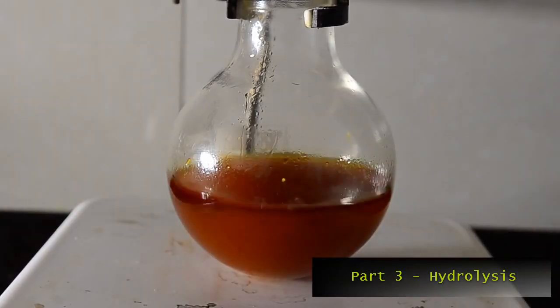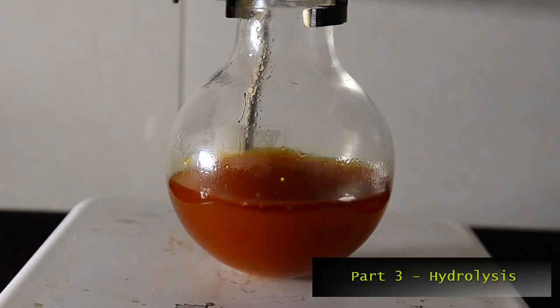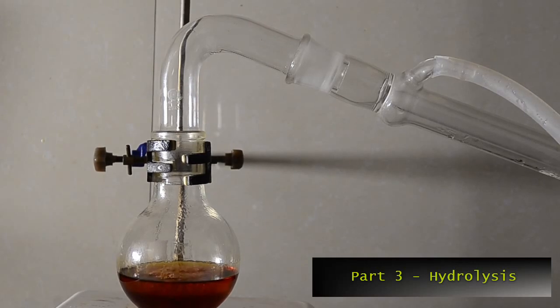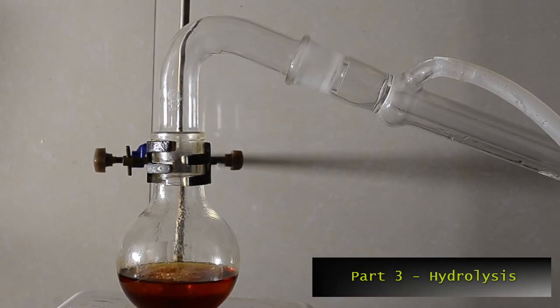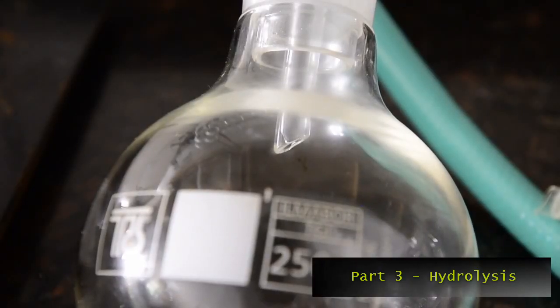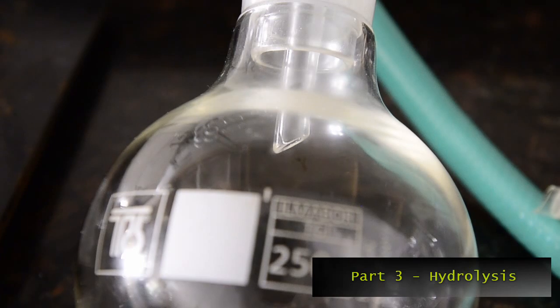Stir the mixture using a magnetic stir bar and set up for simple distillation. We will distill off the toluene from the mixture and perform the hydrolysis at the same time. As you distill you'll see a mixture of toluene and water coming off, which will form layers in the receiving flask.